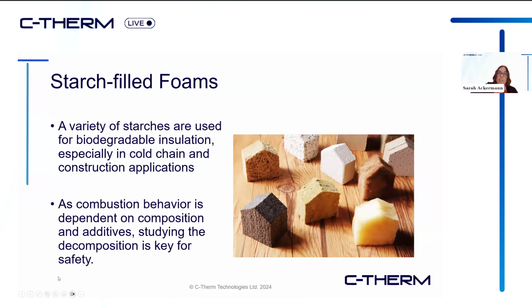The next application note we'll take a look at is looking at starch-filled foams. A lot of starches are being used for biodegradable insulation types of applications. I've seen them most often in cold chain and construction applications with our clients, but they're being used in other areas as well. Basically anywhere where a biodegradable but thermally insulative material would be advantageous.